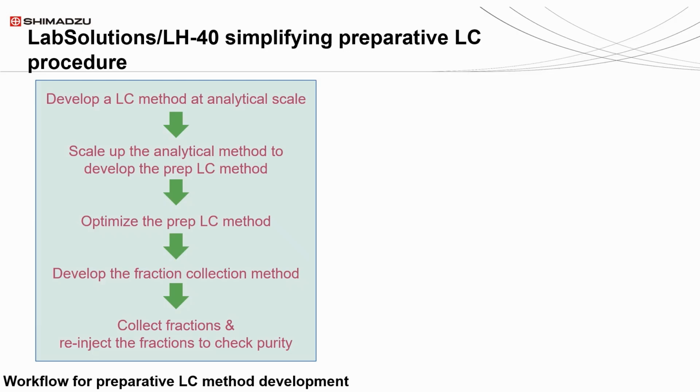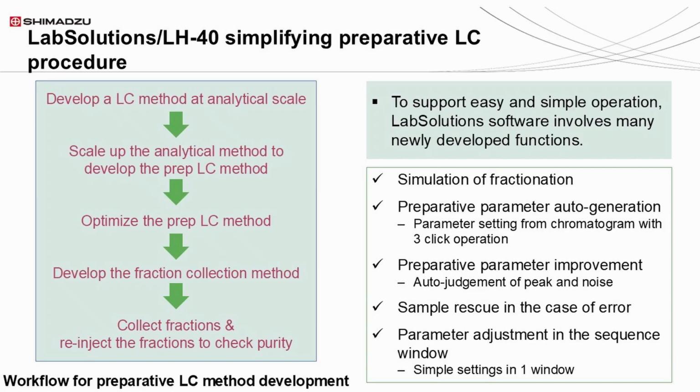Firstly, we would develop an analytical LC method, scale it up to become a preparative LC method, optimize the LC method, and then develop the fraction collection method. After all that, we would collect fractions to re-inject for purity checks.